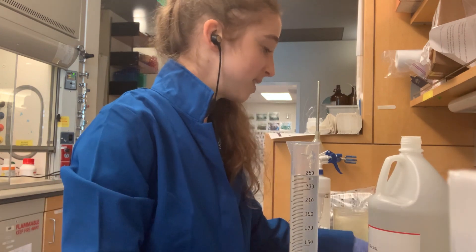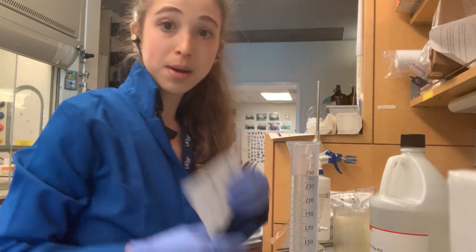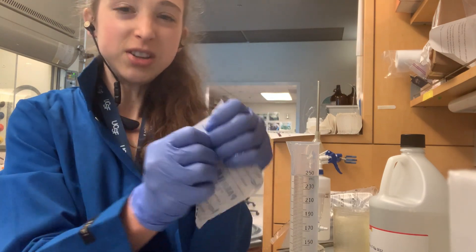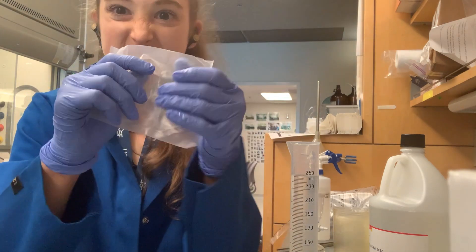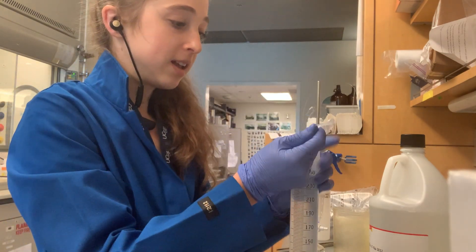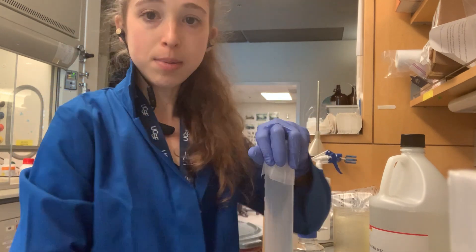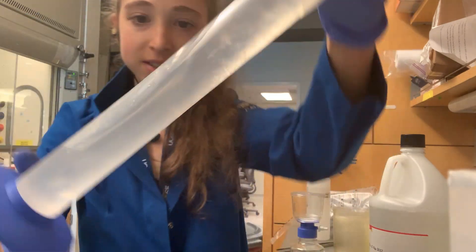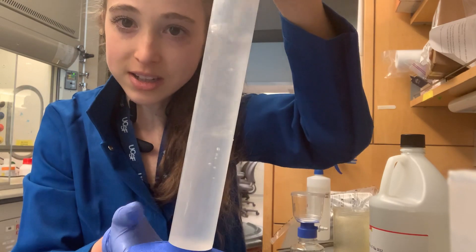Now I need to mix this, and to do that I'm going to use my favorite thing in the lab: parafilm. Parafilm is kind of like a cling wrap, but it's thicker, and it's super useful for all sorts of things including mixing solutions. You just put it over the top, invert, and you can see it's all mixing together — you have this really viscous liquid in there.